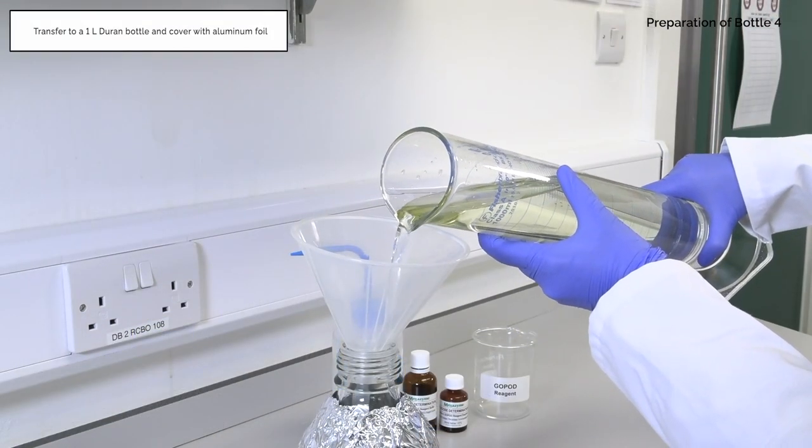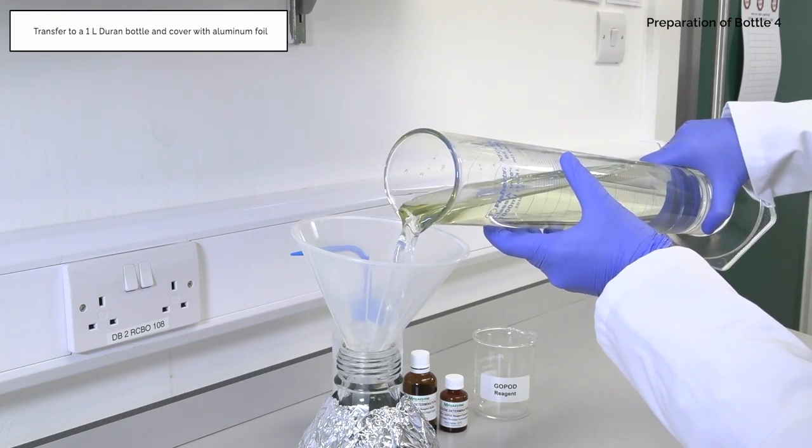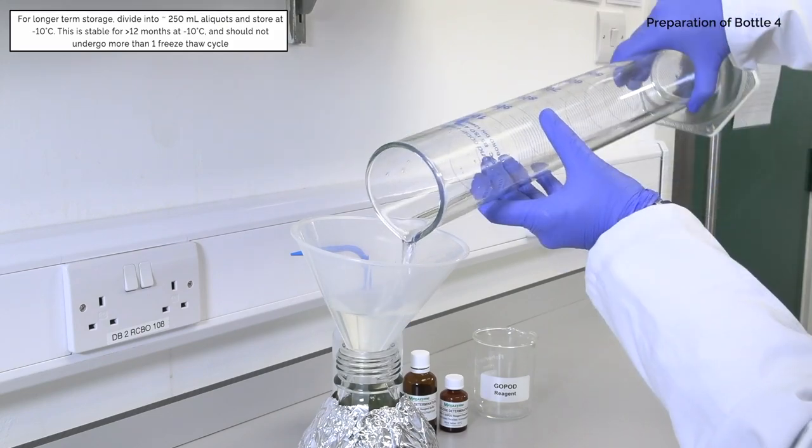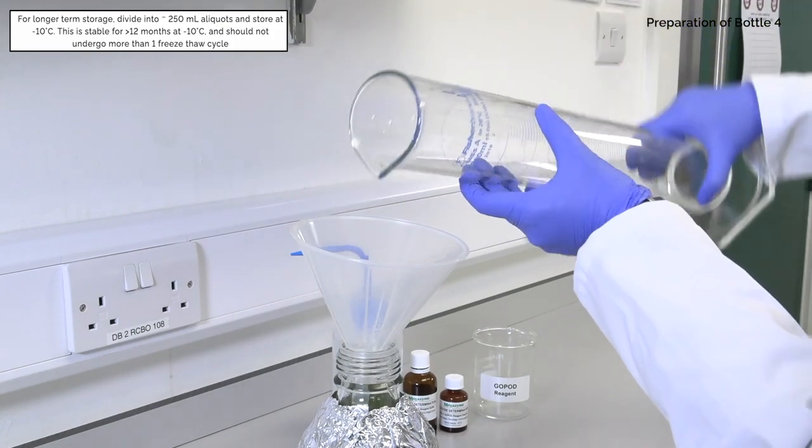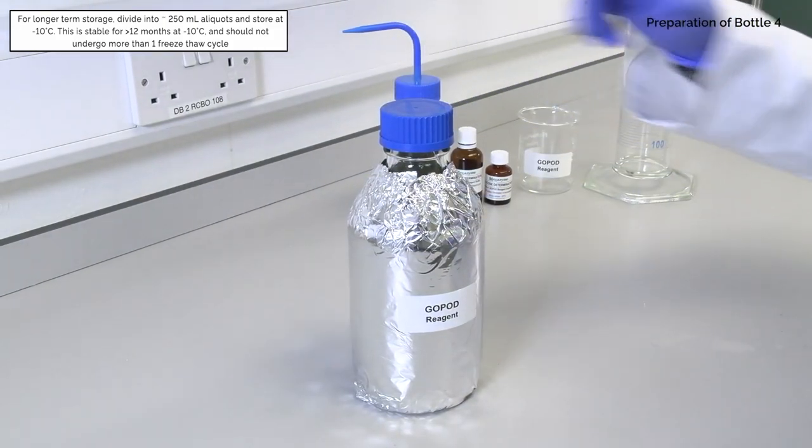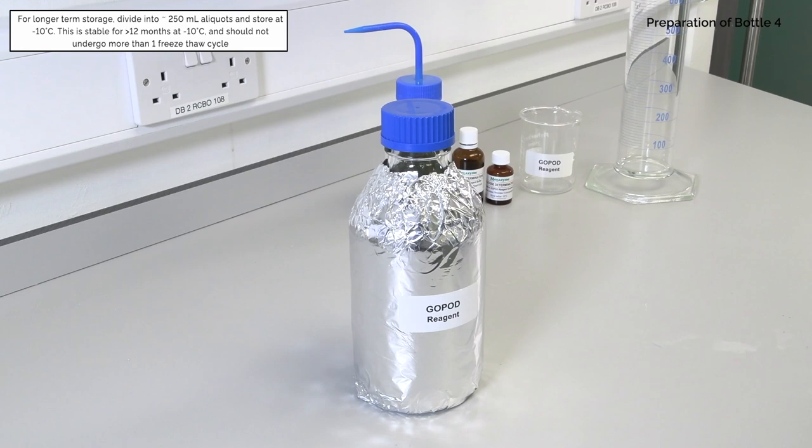Transfer to a 1 liter Duran bottle and cover with aluminum foil. For longer term storage divide into approximately 250 milliliter aliquots and store at minus 10 degrees Celsius. This is stable for greater than 12 months at minus 10 degrees Celsius and should not undergo more than one freeze-thaw cycle.